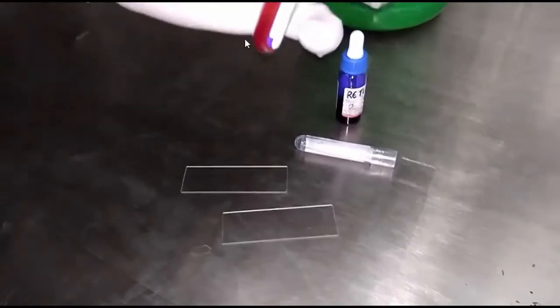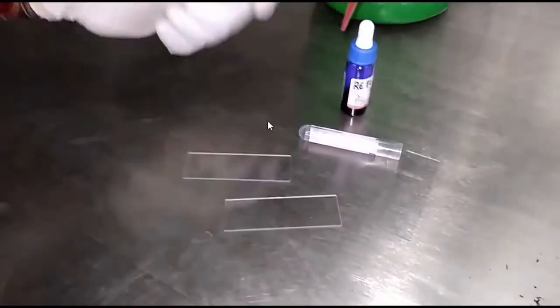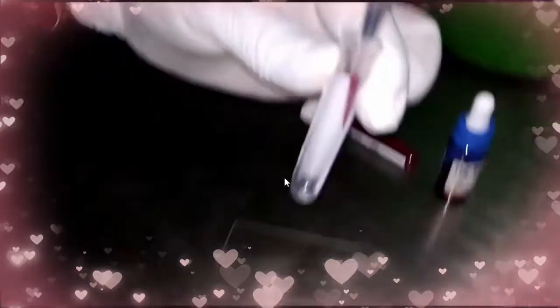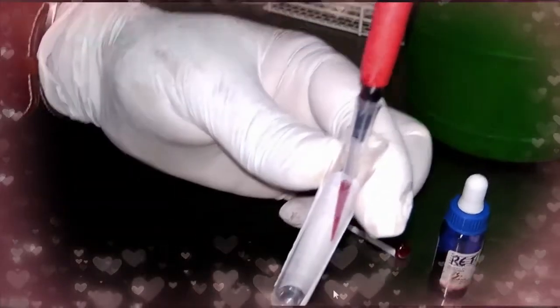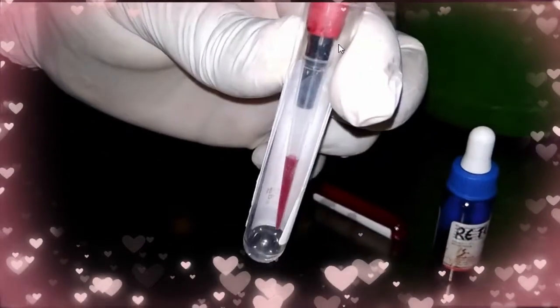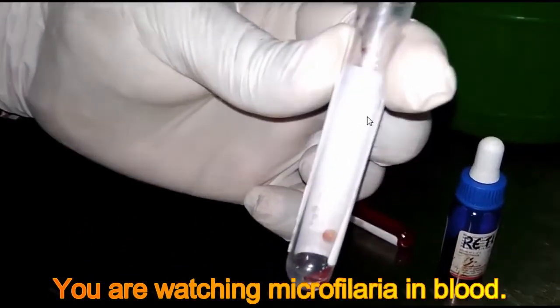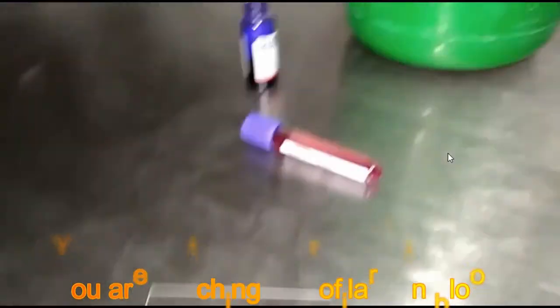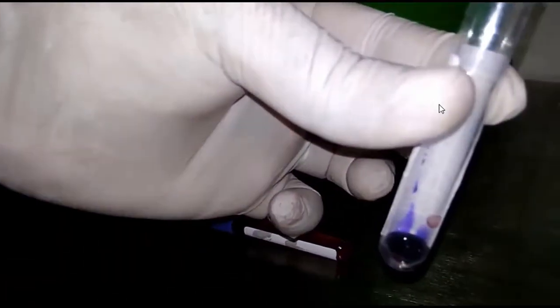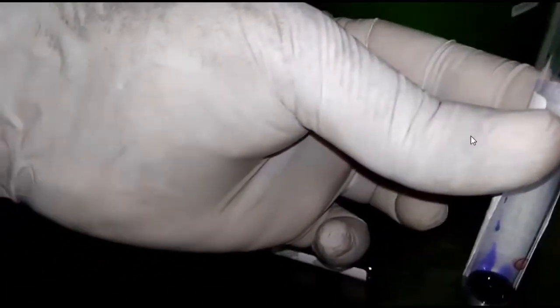This one is EDTA blood. This one is slides, test tube, micropipette, and microscope. So take equal amount of blood and vital stain.